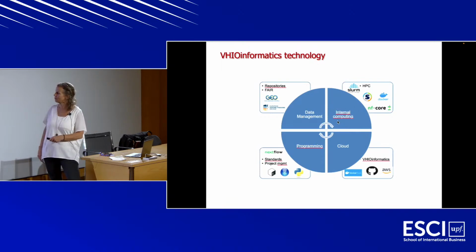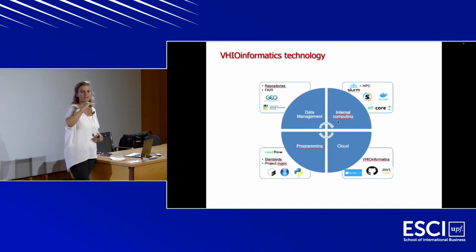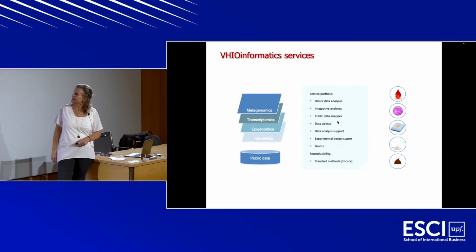We also use the cloud. We have our code in GitHub in bioinformatics, and we use standards for programming. We do our best to follow them, and we program basically in R and Python, and we use some tools for project management. And we follow those standards, and we upload the data. When we have analyzed the data, we need to upload this data to be published. And yes, this is our service, and this is what we do.